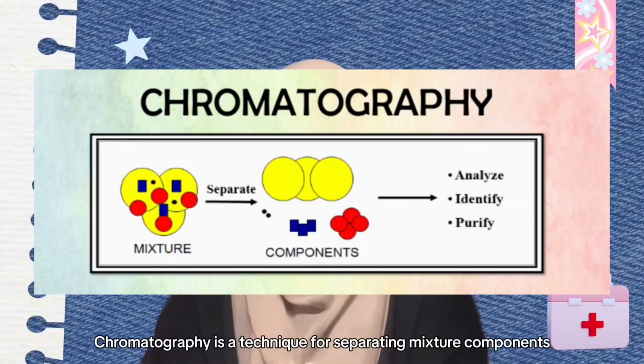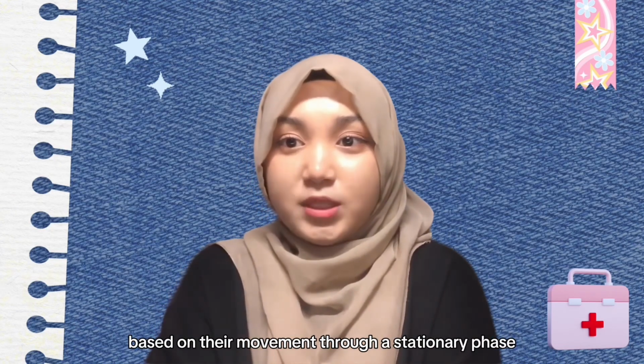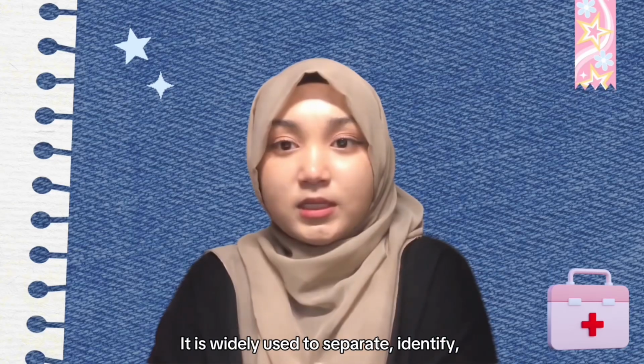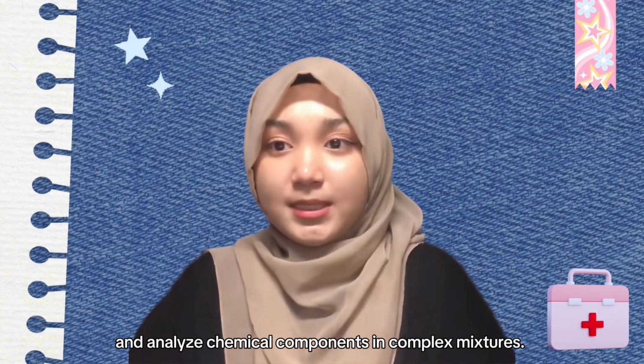Chromatography is a technique for separating mixture components based on their movement through a stationary phase using a liquid or gas mobile phase. It is widely used to separate, identify, and analyze chemical components in complex mixtures.